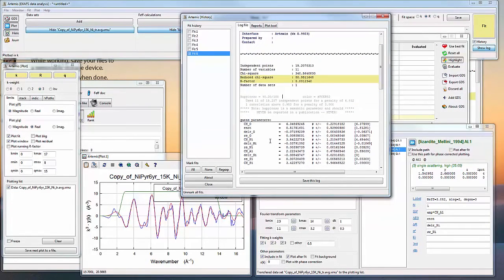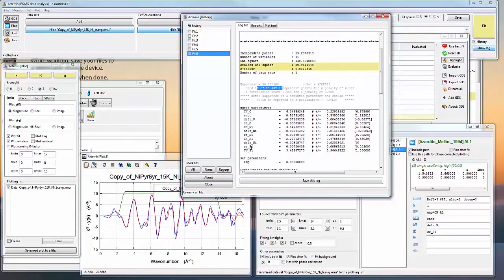So how can I restrict this fit, which is a way to break correlations and also reduce the number of independent points? So I see my sigma squared is at 0.007 plus or minus 0.005. That falls within the error range of the sigma squared for the second shell here, which is actually a little bit low. It's lower than the first one, so that's not ideal.